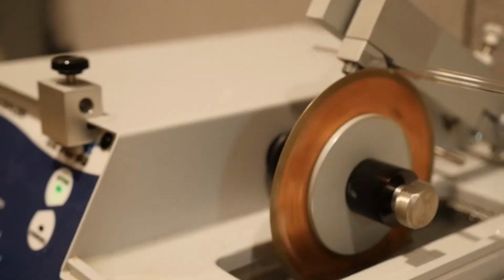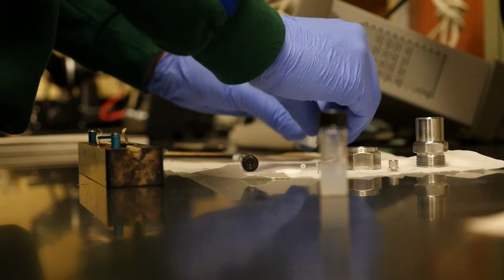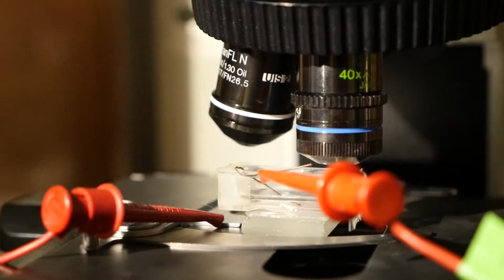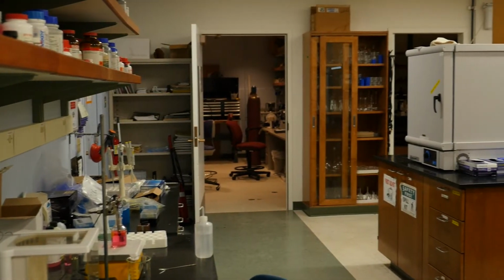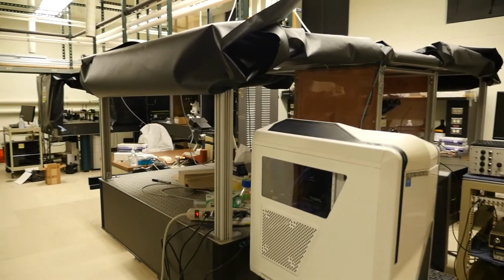My students and I work in the exciting area of electrochemistry, where we develop and use microscopy tools to study the electrochemical interface. Two of the projects in our current research are the study of nanoparticle collision and oxidation behavior, and the nucleation and growth of nanobubbles, all at the electrochemical interface. In a more recent study, we also developed tools where we can detect coronavirus particles one at a time.